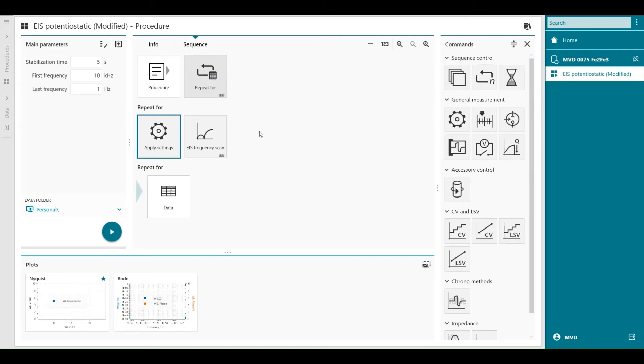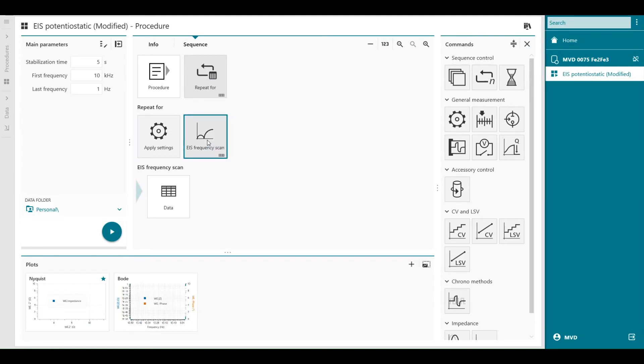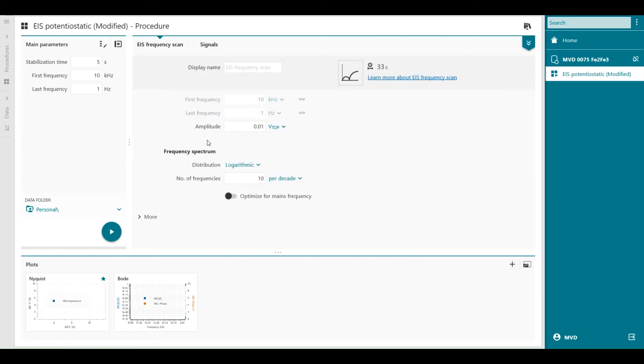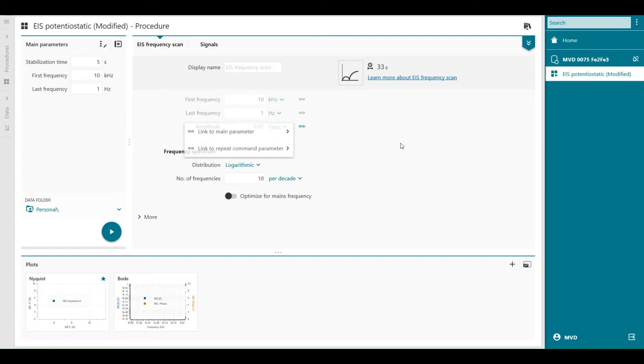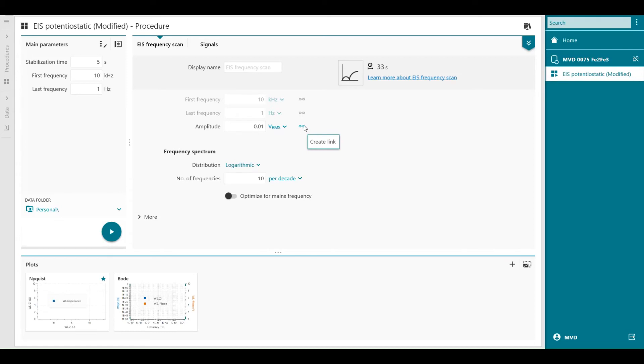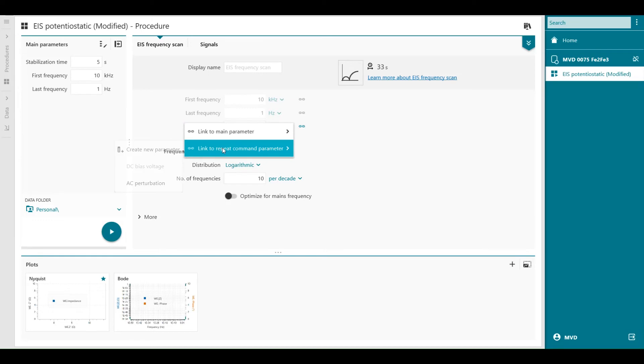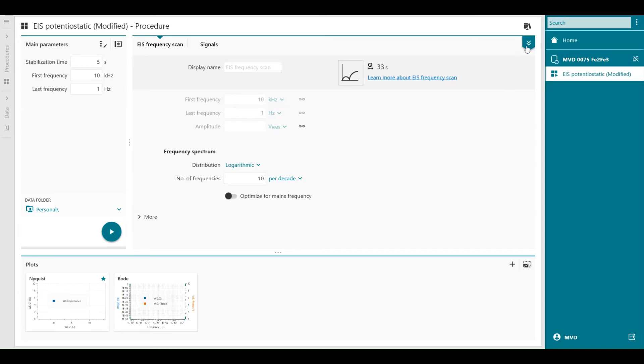And then I can do the same for the EIS frequency scan. Double click on it. First I'm going to modify to root mean square voltage. And I can link the repeat command to the AC perturbation. So here is the amplitude in my EIS frequency scan. And with this button here we can create a link to the table. So link the repeat command to AC perturbation.